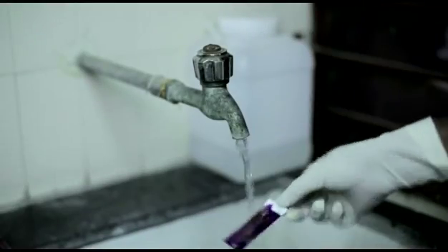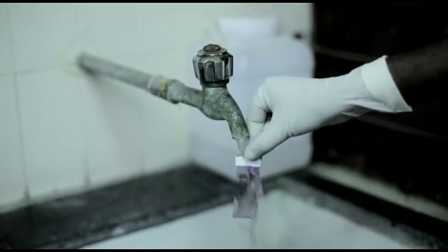Leave to stain for 15 minutes. Wash off the stain with tap water. Dry the slide upright. The slide is now ready.